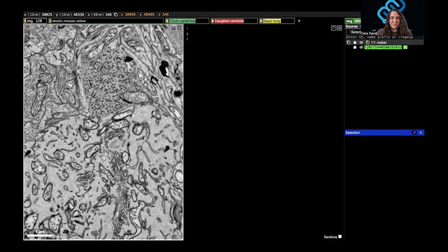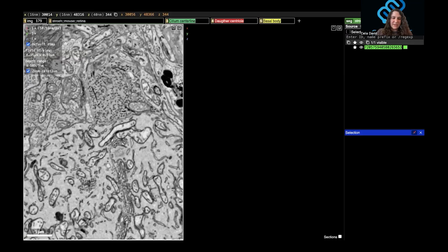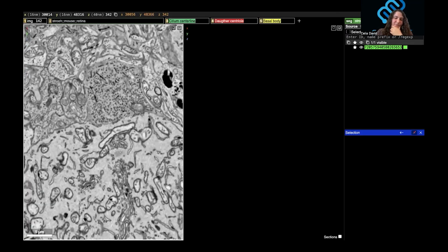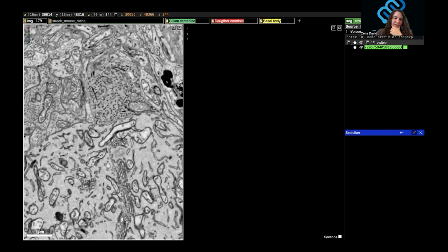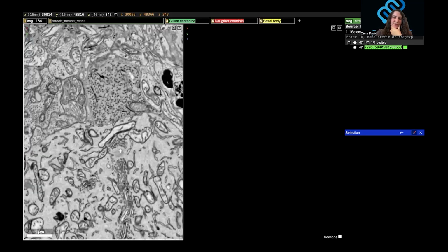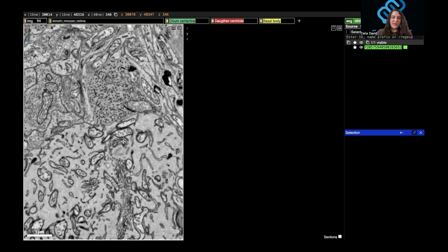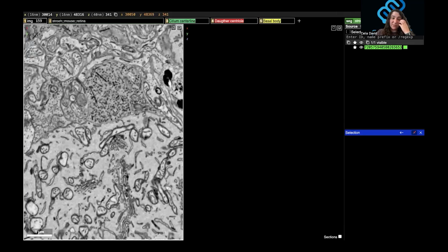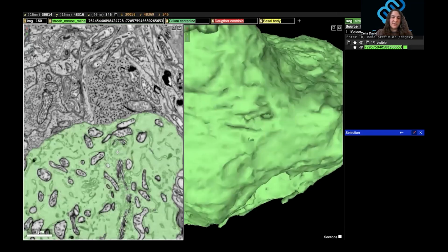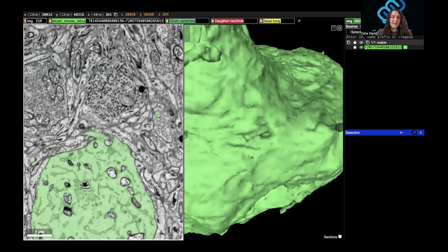And there's multiple ones in the cell, but usually the cilium or the centrioles are going to be surrounded by some of this stuff. So you can see this empty pocket with this area in the middle. That's what you want to be looking out for. So I can see that here. So that means that we're on the right track, and then it's exiting.